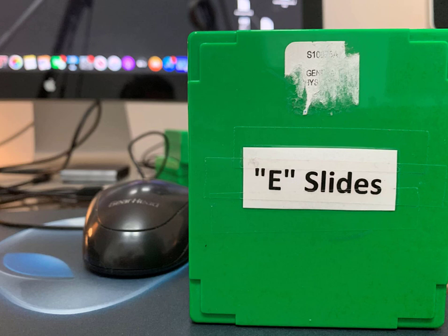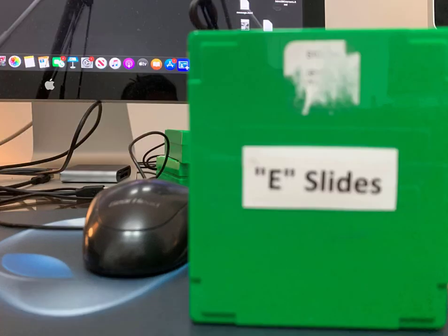This is also a technique used in portrait photography, where you capture the person but the background is blurry. This demonstrates a much smaller depth of field, so that if you want to change focus, you'll actually have to refocus onto another subject. For example, if instead of looking at the eSlides label on the slide box, we wanted to look at the icons on the computer screen, we actually have to change focus — which on the microscope is accomplished by the use of our fine focus knob.